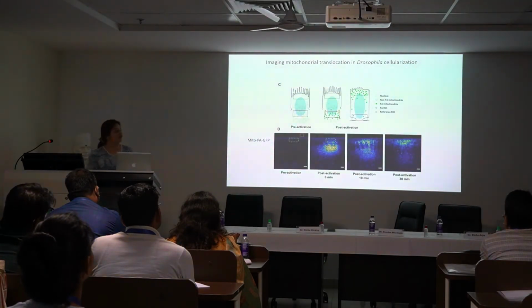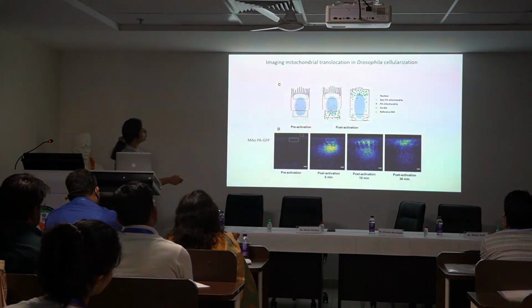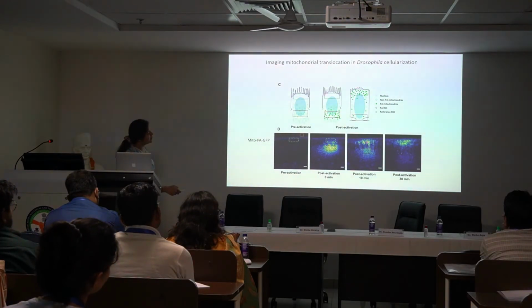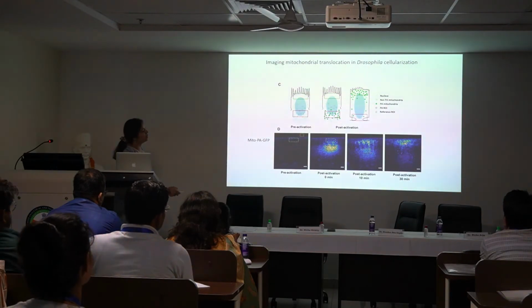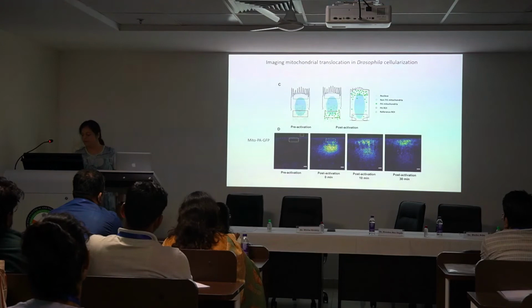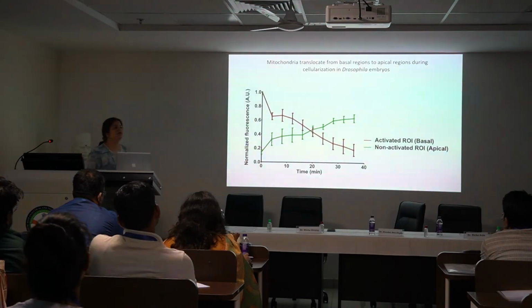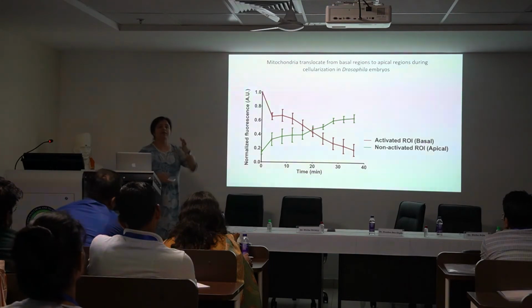And then one can do an interesting photoactivation experiment with mito-PAGFP, where we can photoactivate a region below the cells, and what one sees over time is that there is an accumulation of fluorescence now on the top, right? So all the fluorescence over here now is on the top, which means that there is this translocation event which is taking place. So photoactivation as a tool is a fantastic tool to follow a signal live and to see where it is going, right?